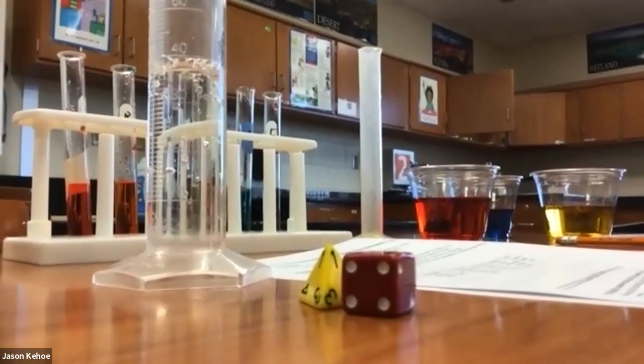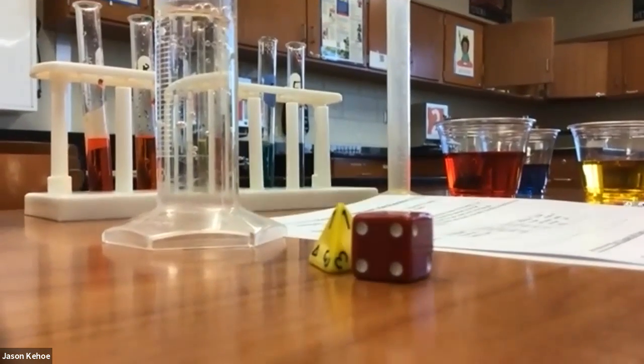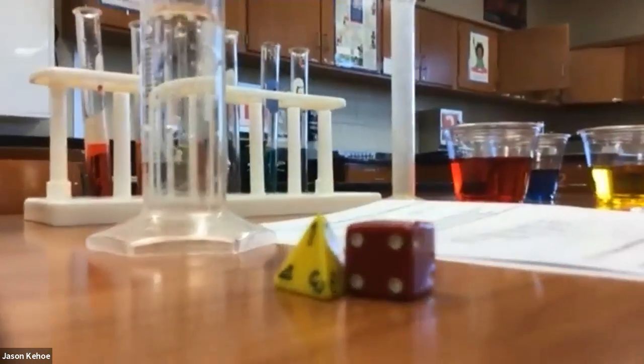Not quite 40. 40. There we go. So that is the volume before adding the items. 40 milliliters.